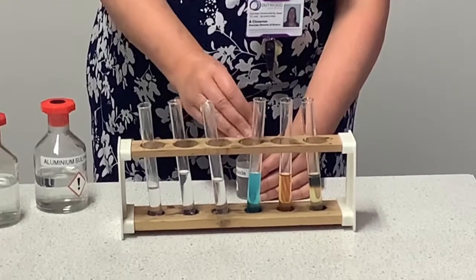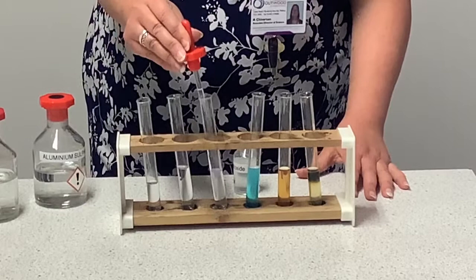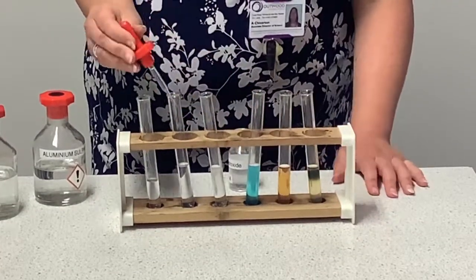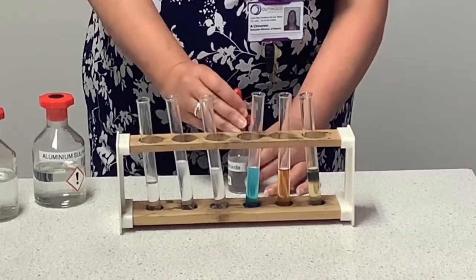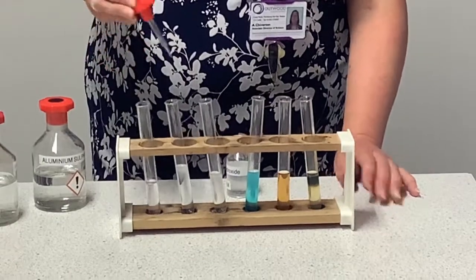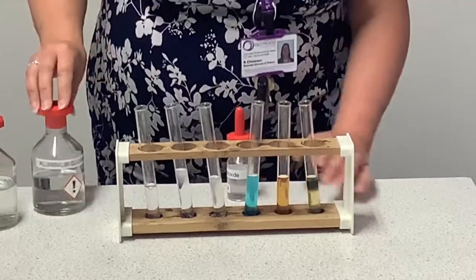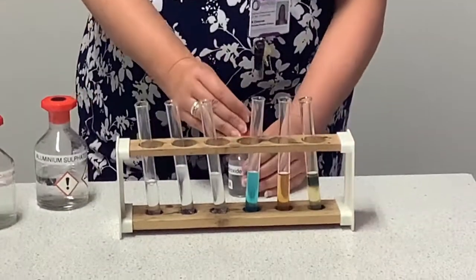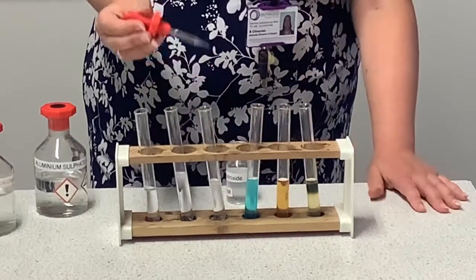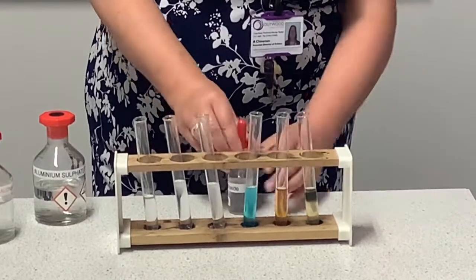So again, we're going to use the sodium hydroxide solution, and we're going to add some to each of the tubes. And what you should see forming is a white precipitate. So with that white precipitate, it eliminates the other ions, but it doesn't give us the difference between the aluminium, the magnesium, and the calcium. So what we can then do is add additional sodium hydroxide and see if any of those precipitates disappear.